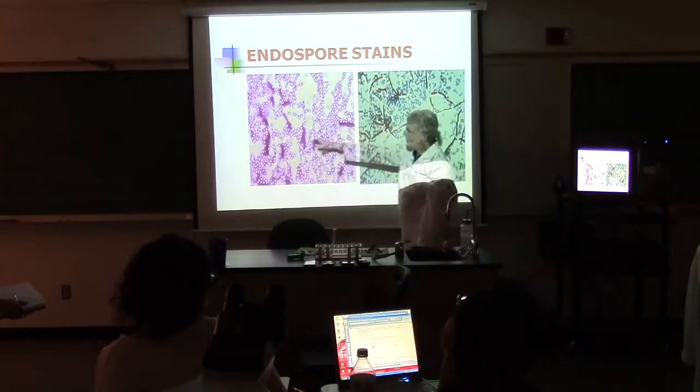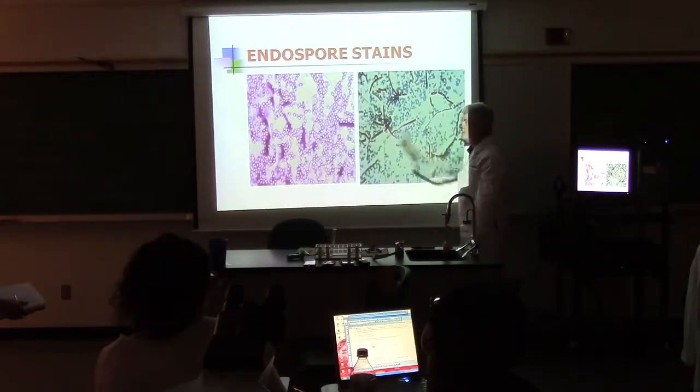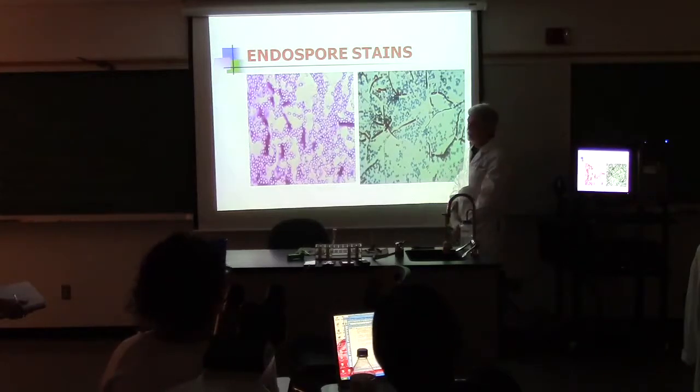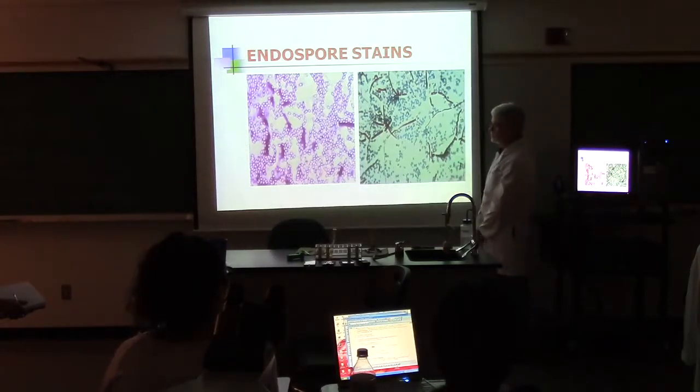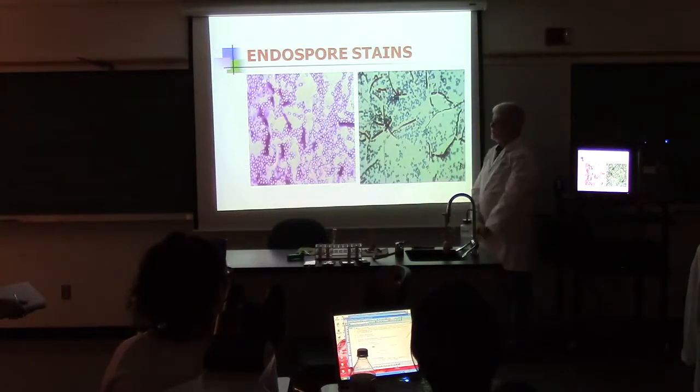And of course it's gram positive. Here's that very same microbe, same culture, done with a proper gram stain. I mean a proper endospore stain. Now, let's just ignore green and answer the question. Is this an endospore stain? Yes. You've got pink and you've got green.